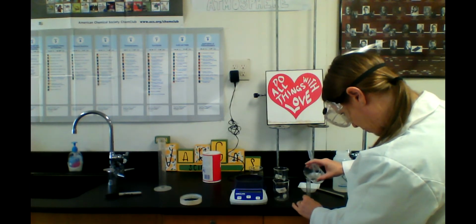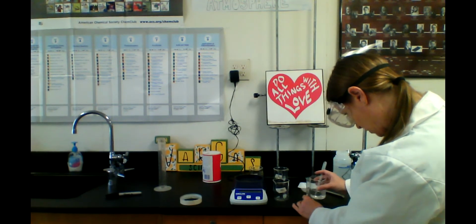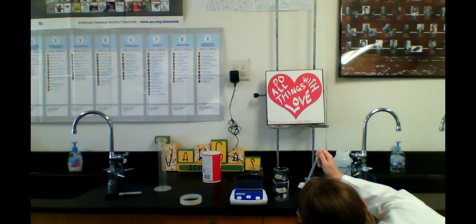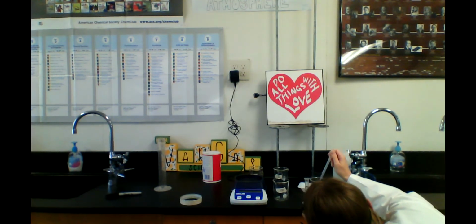Okay, so let's use our stock solution. We're going to fill this up to about 7. And I'm going to use the pipette for that last 1 milliliter from the bottom of the meniscus. Okay, and the meniscus is much more pronounced in this one than it was in the large one because I have such a small, a little bit too much, so I'm going to take a tiny bit out. Too much. There we go, perfect. So we have 8 milliliters of our stock solution goes into the 10. Okay, so there goes my 8 milliliters into there.